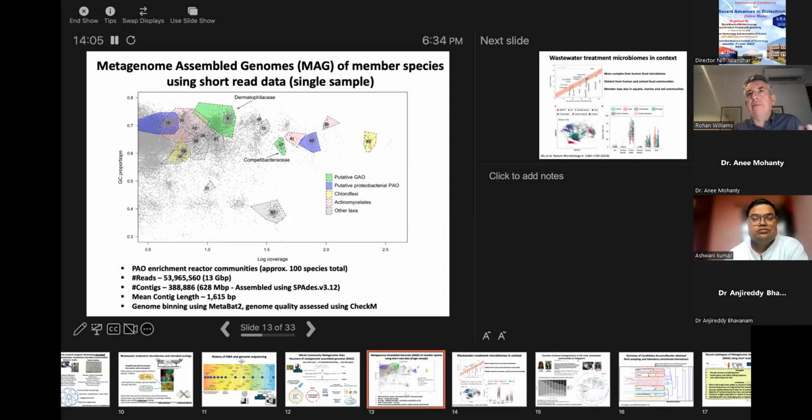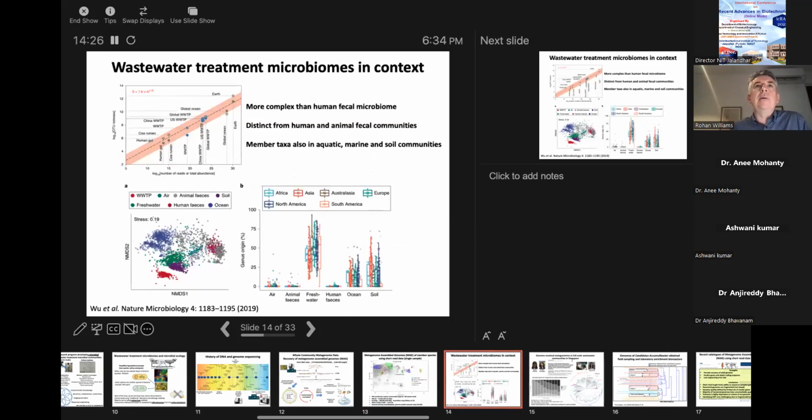So they're very fractionated, they have multiple contigs, but under a given analytic model and hypothesis, we can say that they're likely to mostly be from the same genome. And the way of doing this now is very standardized. It's almost a push-button procedure, but of course you still have to look at the results.